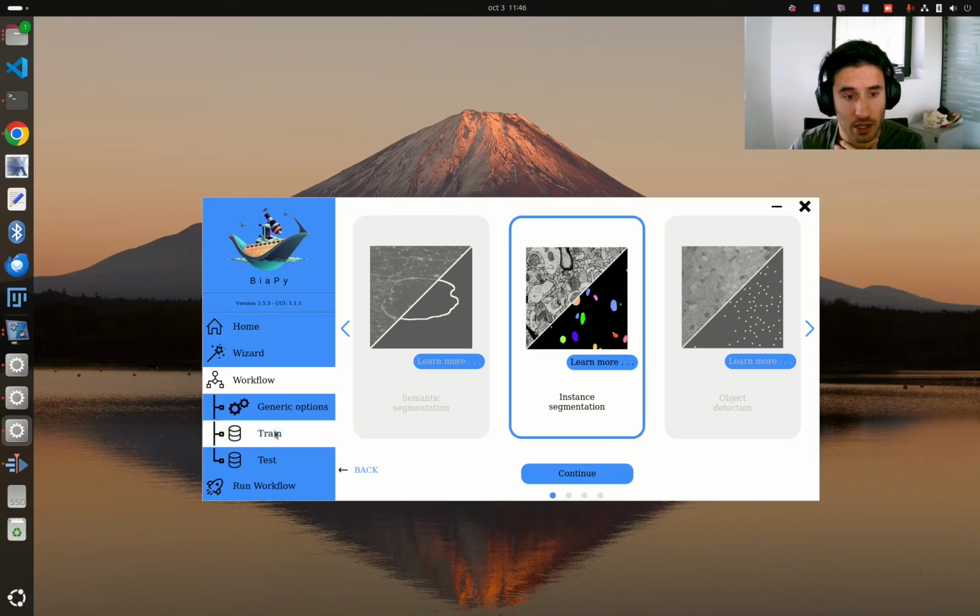Okay, because configuring a workflow through these windows is going to be covered in the videos for each workflow that we are going to do. Okay, but just so you can have a rough idea, in this window you will find the option to change the workflows.